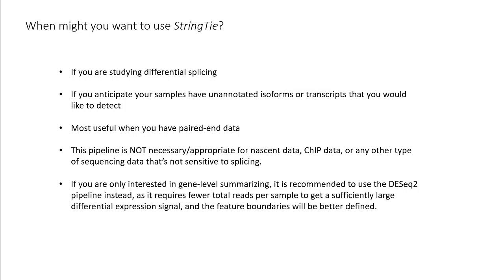In the subsequent videos, we will discuss how ball-gown utilizes the output of Stringtie.